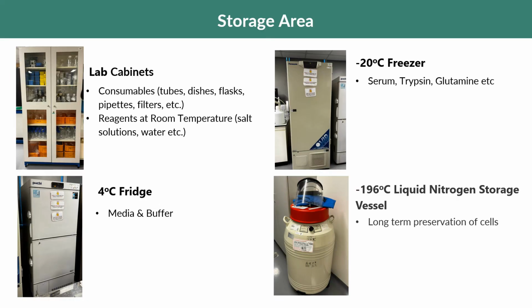Cells frozen under suitable conditions can be stored in the short term for a few days, but generally if you store them between a 4 degree fridge and -80, they will definitely lose their viability. Okay, so generally we don't freeze cells in a -20 or -80 kind of freezer.